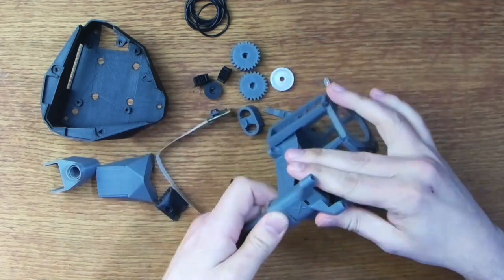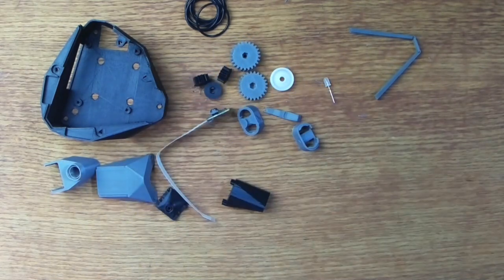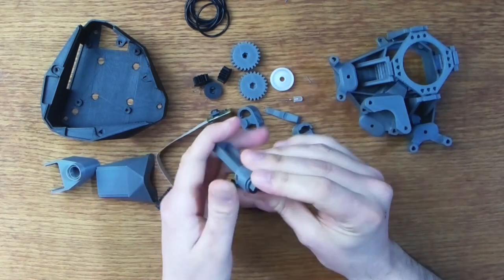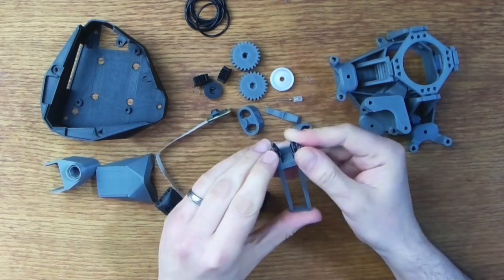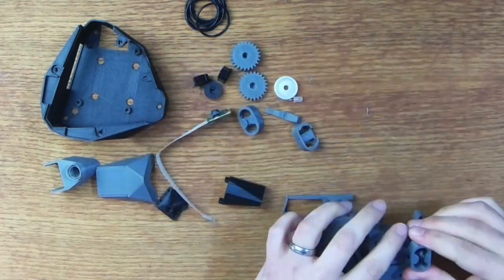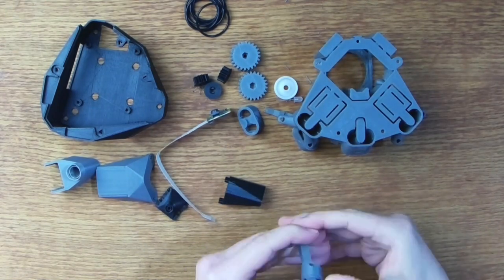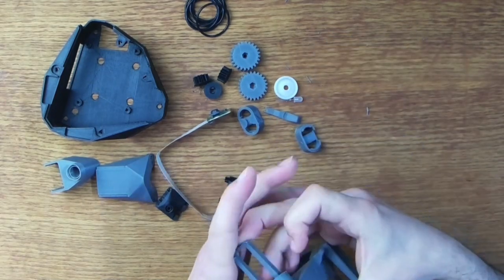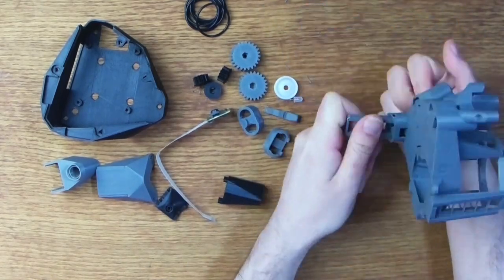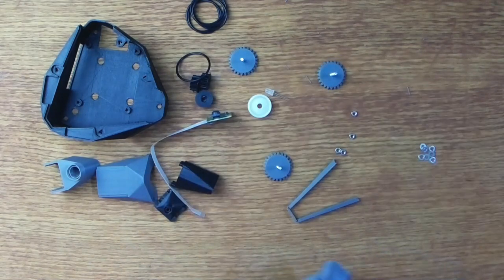Next, I figured I'd get the tricky O-ring insertion step out of the way. That was actually a mistake. I should have inserted the actuator bolts before fixing the O-rings in place, as those bolts provide support for the plastic parts. Putting the O-rings on first exerts a lot of force on the plastic and makes adding the bolts a lot more fiddly. Anyway, lesson learned: if you're going to build your own OpenFlexure microscope, and I highly recommend you give it a go, then it's probably a good idea to study the published assembly instructions carefully and avoid my mistakes. Anyway, with the O-rings in place, I'm now adding the actuator bolts.